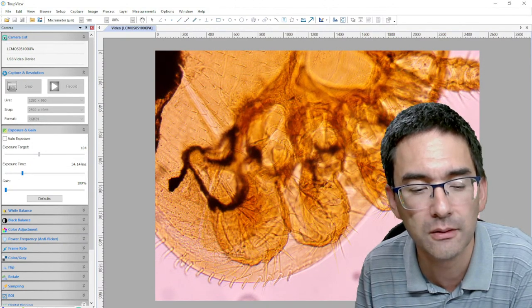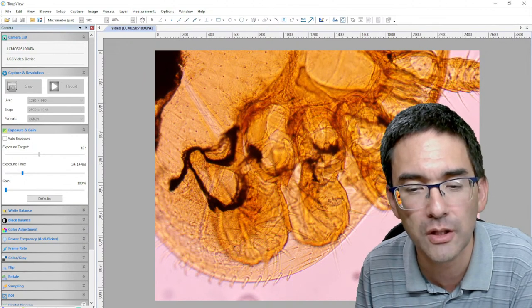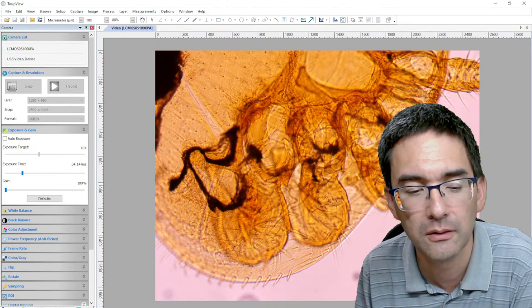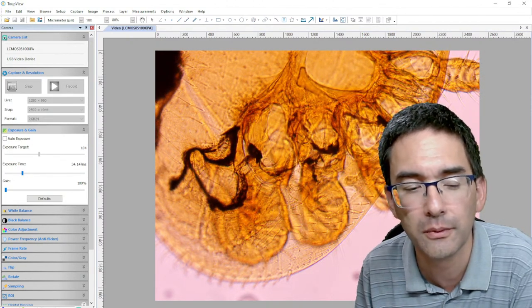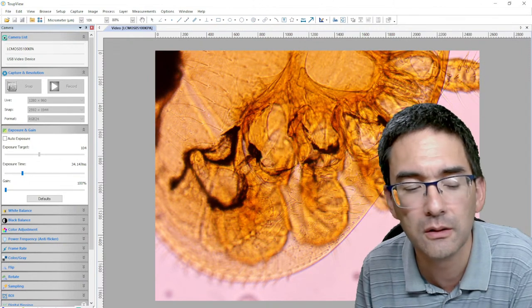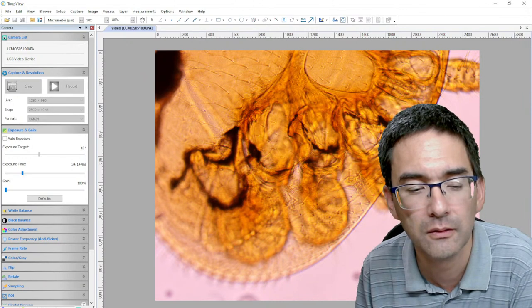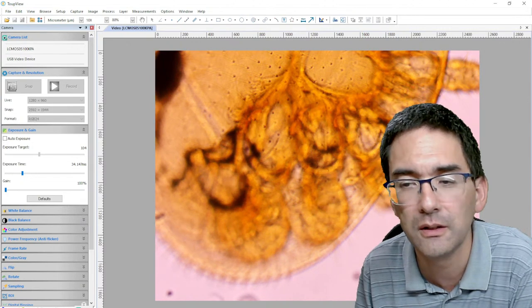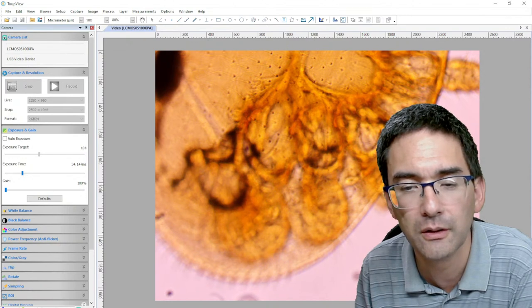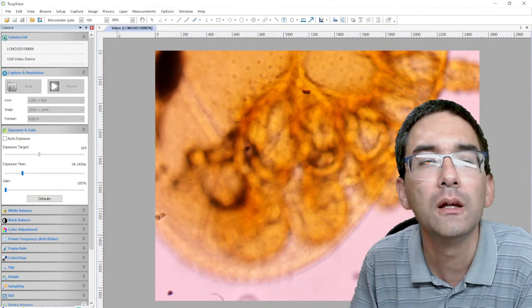So this is image 8, image 9, image 10, image 11, image 12, image 13, image 14, 15, 16, 17. See, now everything becomes blurry. I think we can call it finished. Okay. I stop the process.